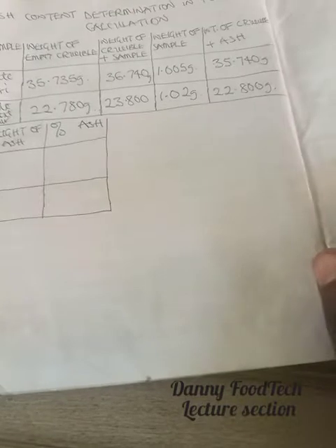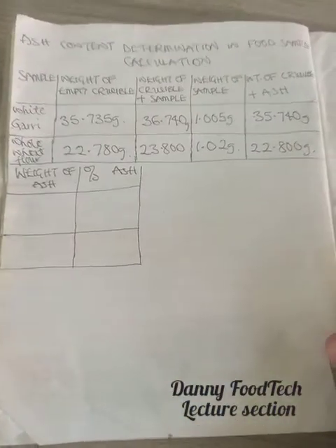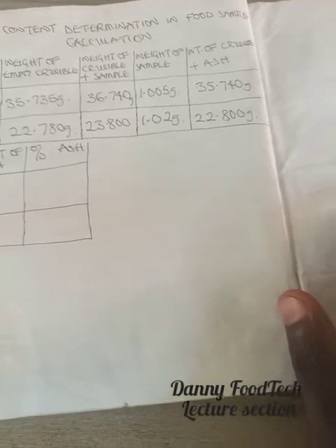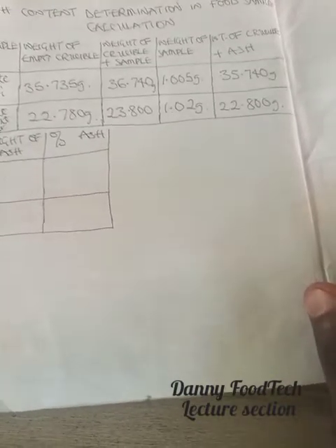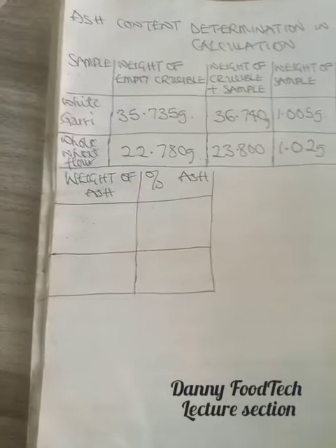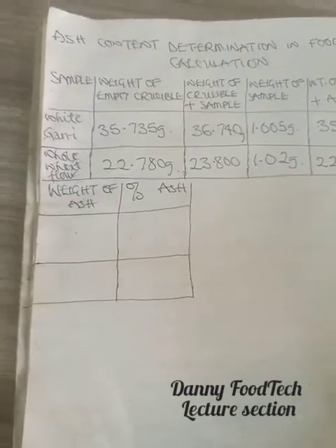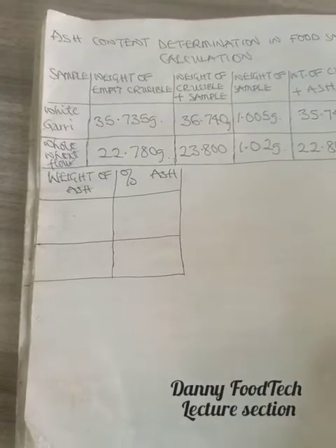In today's video I'll be sharing with you a calculation on how to calculate a percentage ash in a given food sample. In this analysis, we carried out an ash content determination of two food samples, which are white gari and whole wheat flour.